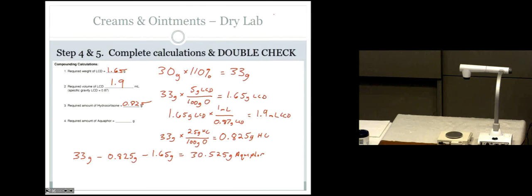Let's just say right now, though, if we needed to levigate this with 1 milliliter, then what would the weight of that 1 milliliter be? You go back to the specific gravity on the front page, right? For mineral oil, it's 0.88. So wouldn't we also need to subtract 0.88 grams for the 1 milliliter of the mineral oil? All right, so I ain't doing that. Why not?